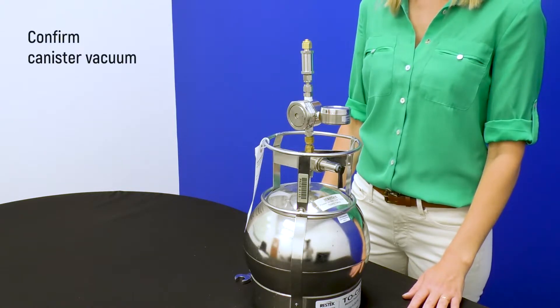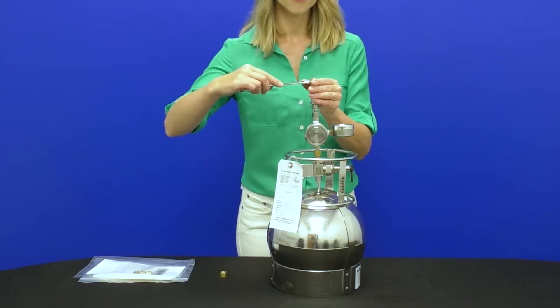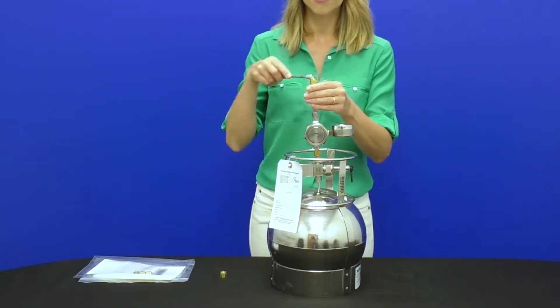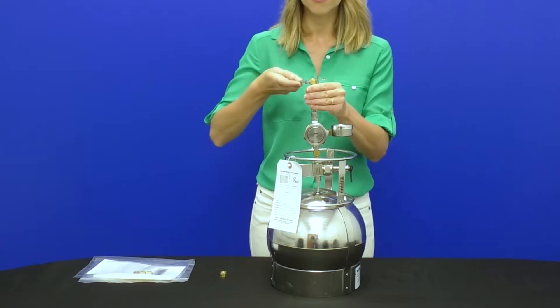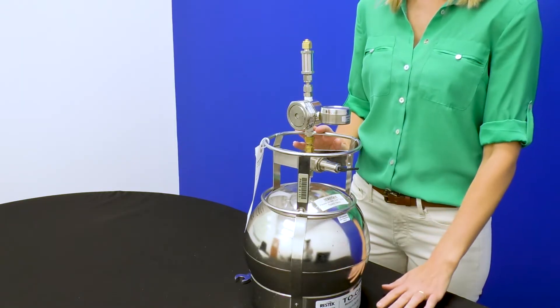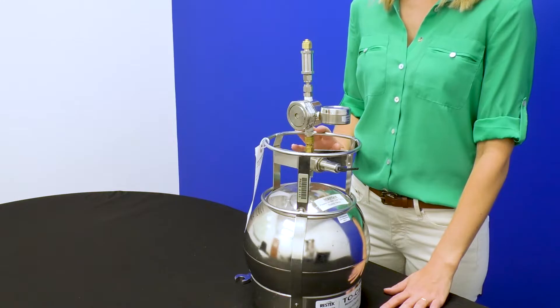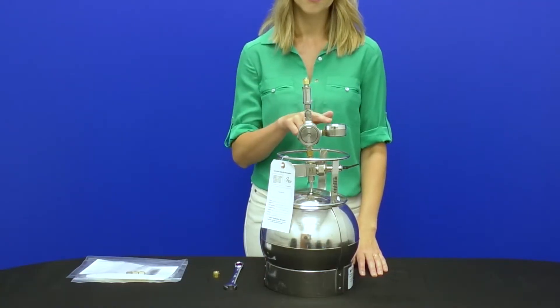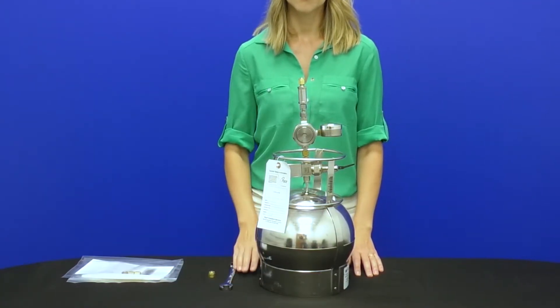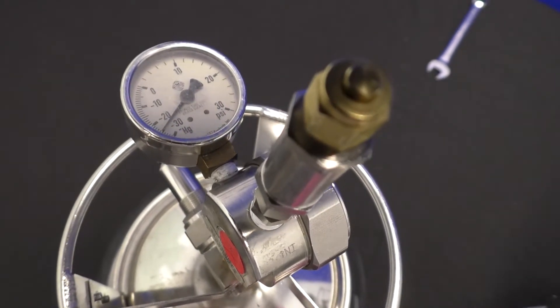Next, confirm canister vacuum after transport and conduct a leak check if desired. Make sure the brass cap at the top of the flow regulator is on tight, then flip the toggle valve to the open position. If your can has a rotary valve, turn one full rotation counterclockwise until you meet resistance. The gauge needle should now drop to between negative 25 and negative 30 inches of mercury vacuum. If it does not, there is a problem and you should reach out to your contact at Pace.